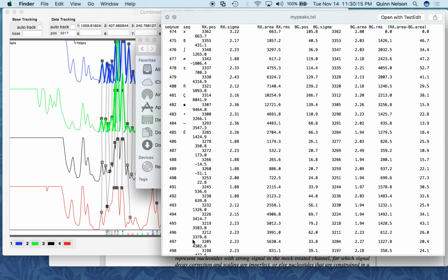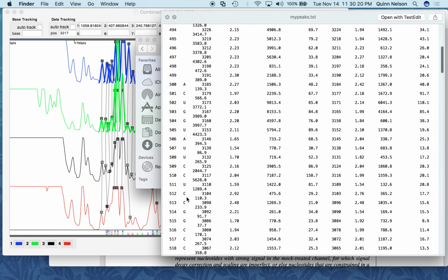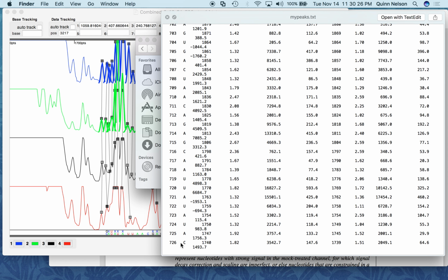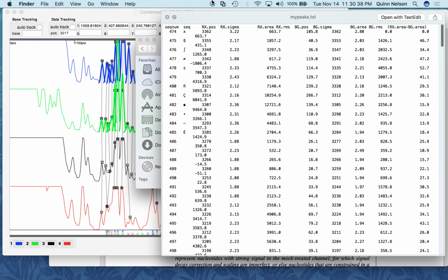So the sequence didn't read for that region. And if you remember, I specified 500 and above. Well, it got the 500 and above sequence. Great. Wow, all the way back up to 726. This wasn't just a good read. This was a great read. Yeah, this was good. But I'm not satisfied with these 25 nucleotides that don't have a sequence.